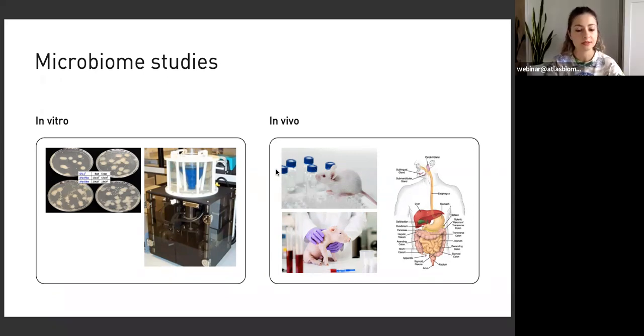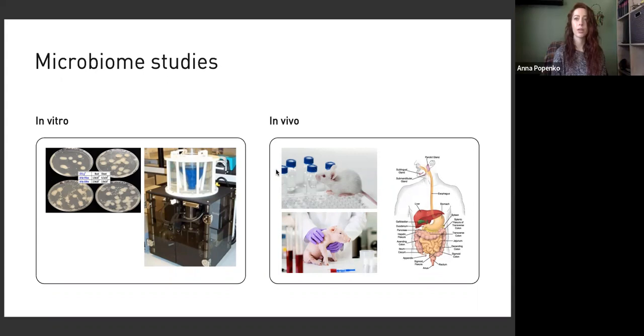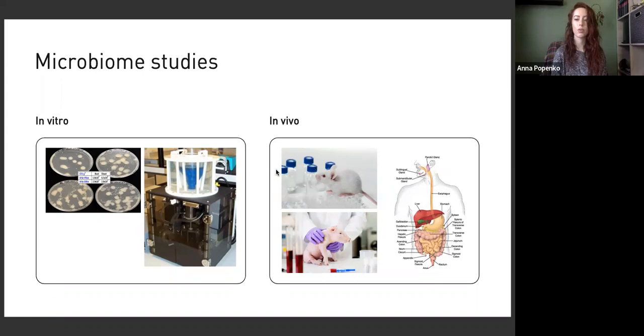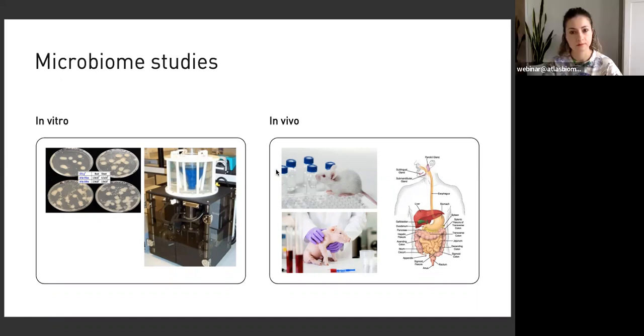Yeah, because sometimes even in our results, you can have two bacteria that are linked together, like Escherichia and Shigella. Is it because their 16S is very similar and the technology can't exactly detect which one it is? Is that correct? Yes, that's true. Whole genome sequencing is a solution to actually detect exactly which one it is. And even more, whole genome sequencing can identify different Escherichia coli and separate, for example, pathogenic E. coli from the ordinary ones. I think that's where we need the next answers to some of our questions. That would be really cool.